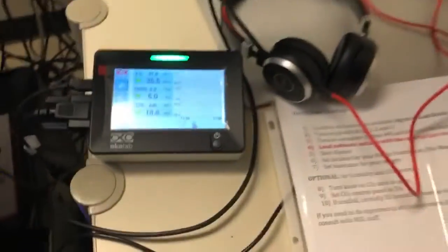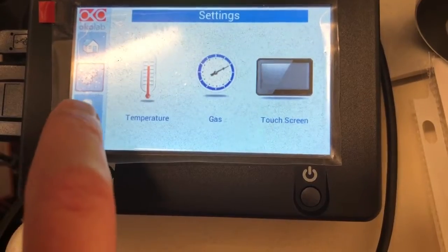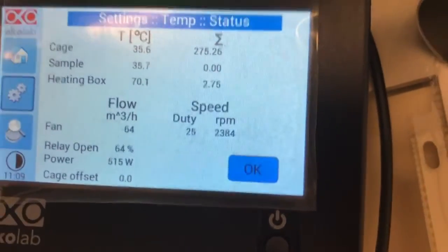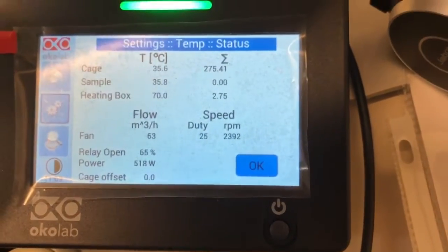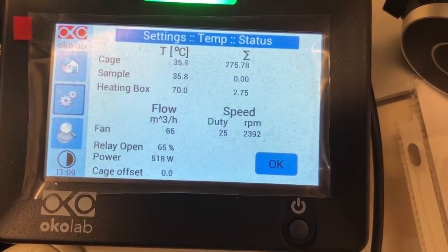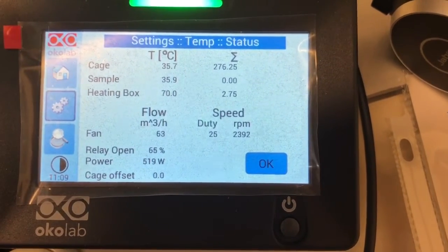You will be able to see the temperature not just of the enclosure — which right now has dropped because I have it open — but also, if you click on these gears and then temperature, and then status, you'll see not just the cage temperature, which is the enclosure, but also the actual sample temperature. Those two usually match within less than half a degree, but if you want to make sure that your sample is at the right temperature, you can verify it with this. You can also let us know if you want the temperature feedback to depend on what's happening next to the sample, as opposed to within the cage. If you want to do that, let us know.